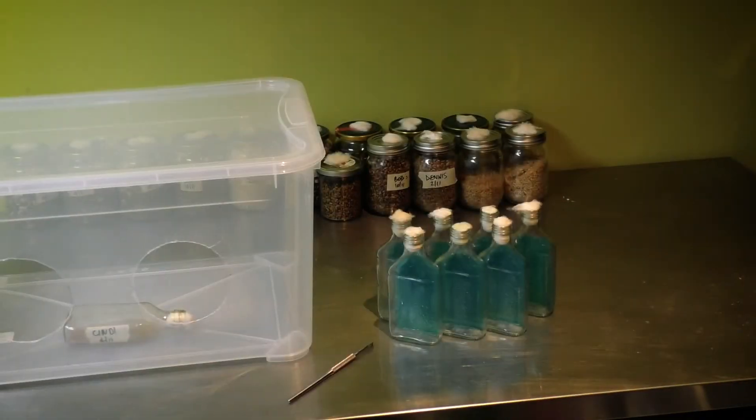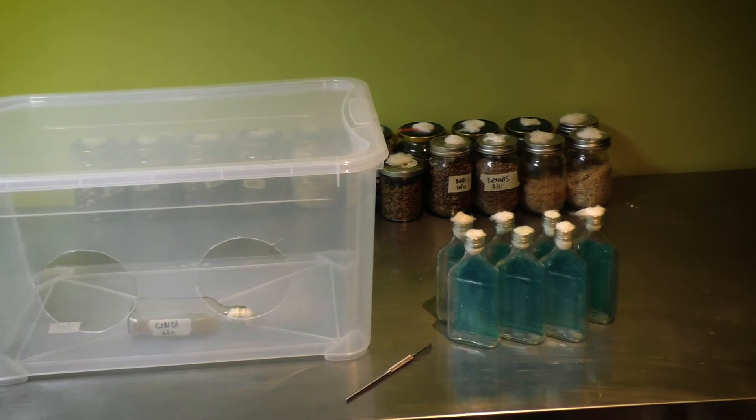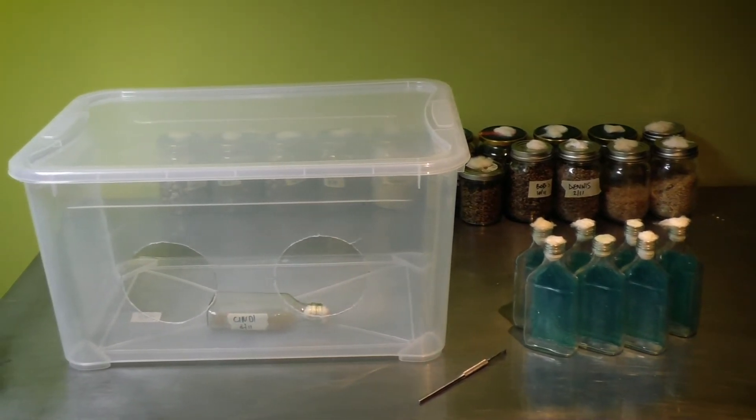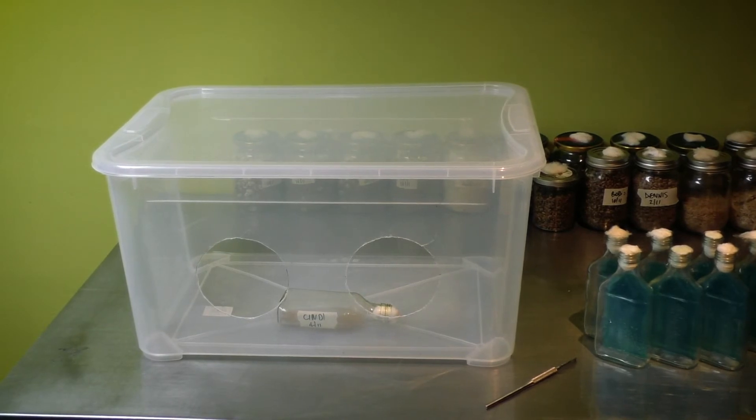I'm using these bottles inside a still air box, which is just a plastic box with a couple of holes cut in the sides for your arms. This is handy because it stops your breath from going onto the agar and also stops any spores, bacteria, or mould that are in the air from contaminating your agar.